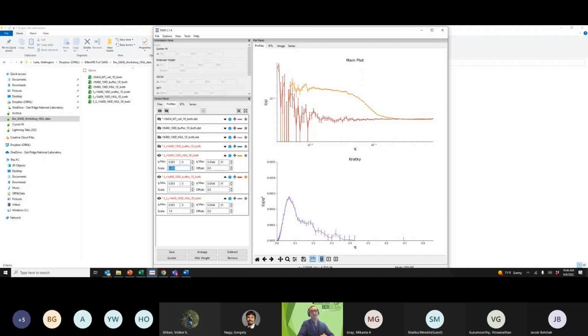If the only effect of this mismatch is the difference in the level of H2O, the way that you can detect this is by looking at the transmission of the sample and buffer. If they have a huge difference in transmission, you cannot really make a judgment on whether you can use the buffer or not, even though it's just a scaling move up and down.